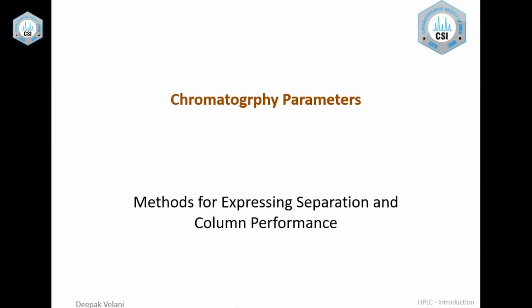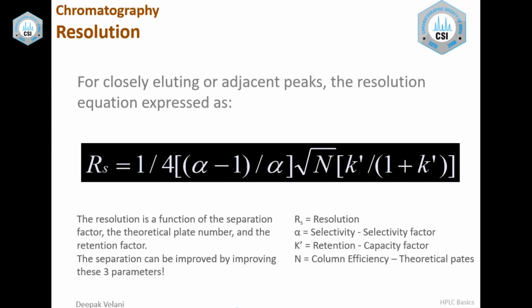Coming to a bit of the theory part, this has been discussed, but what I would like to say is that if chromatography is a movie, then resolution is the hero. If you achieve good resolution, you have three components which support you. We can call them the heroine, the director, the writer or lyricist, whatever. If we can manage selectivity, retention, and column efficiency, resolution is bound to come.